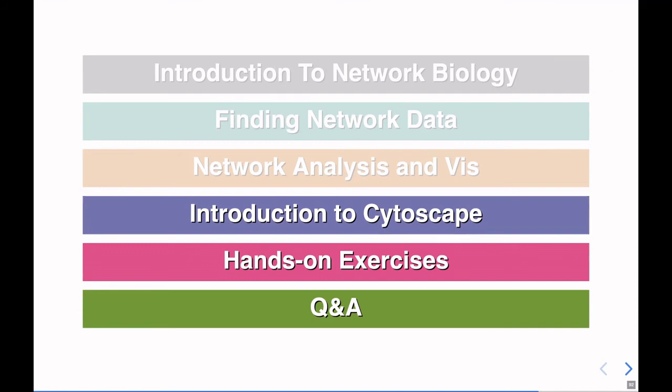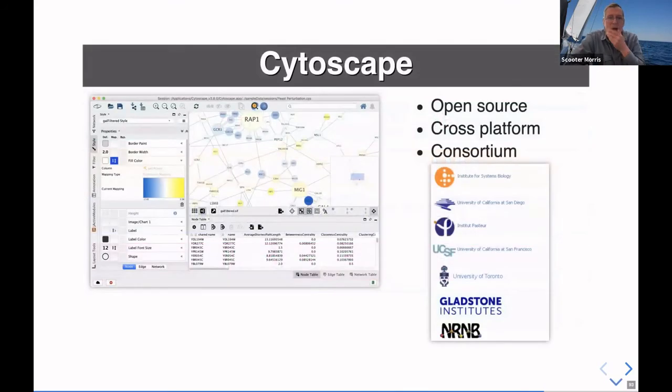Sure. All right, so let's dive into this thing called Cytoscape. A couple of things to note about Cytoscape. It is open source. If anybody doesn't like the way part of it works, you're welcome to download it, fix it and give us a pull request. We would love to see that, and we would be happy to acknowledge it. It's cross-platform, which is sort of part of our bane and our boon. It's great that it's cross-platform, but there are just enough platform differences that we as programmers have to deal with that can sometimes provide a bit of a challenge.